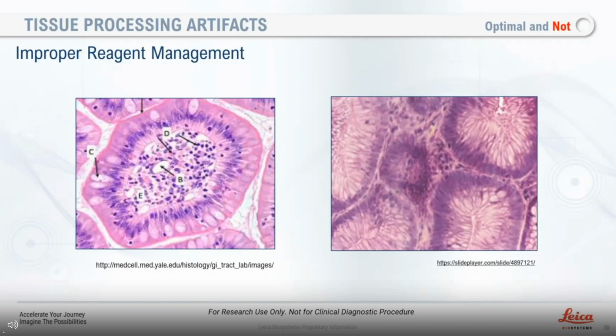Next question. Can the crush artifact come from a tech pressing down on a tissue too hard with forceps during embedding? Absolutely. Yes, care must be taken not only at the board where they're prosecting, but all the way down to the embedding. Yes, great question.